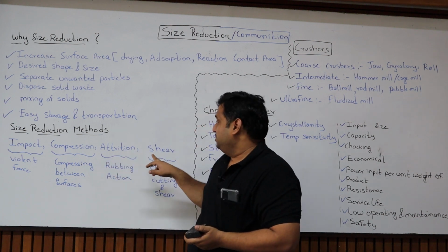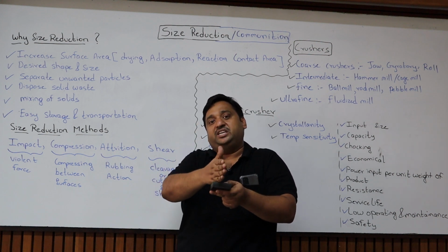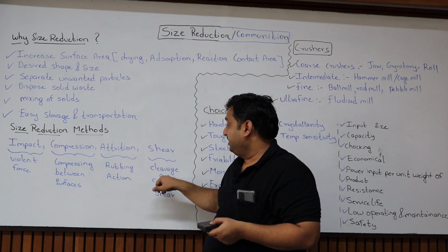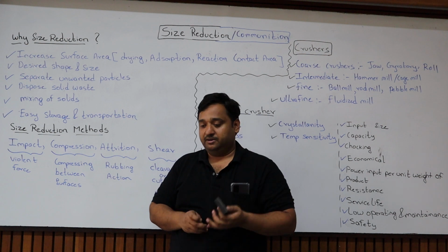Shear is a cleavage action. If I cut this material using a high shear force, like a knife or something else, that comes under shear. It's cleavage, cutting, or shear forces that I am acting on this particle.